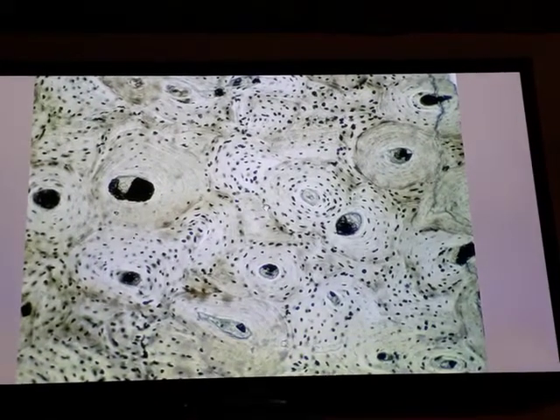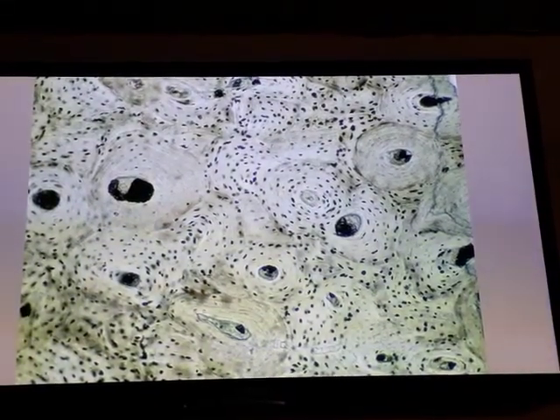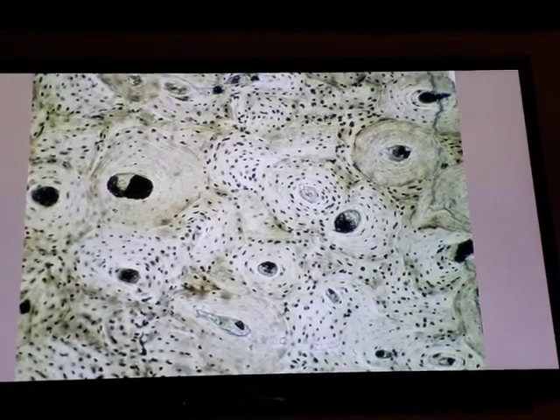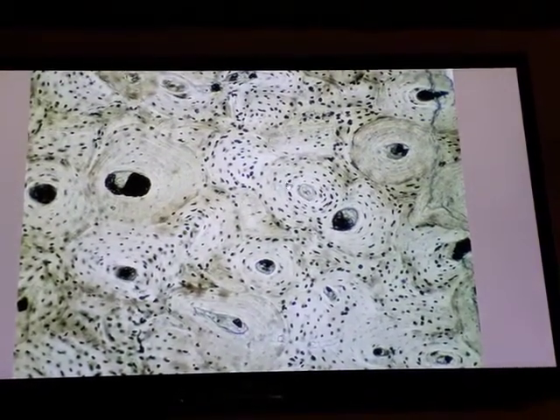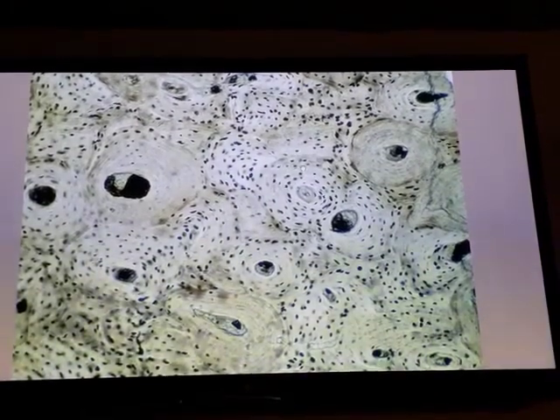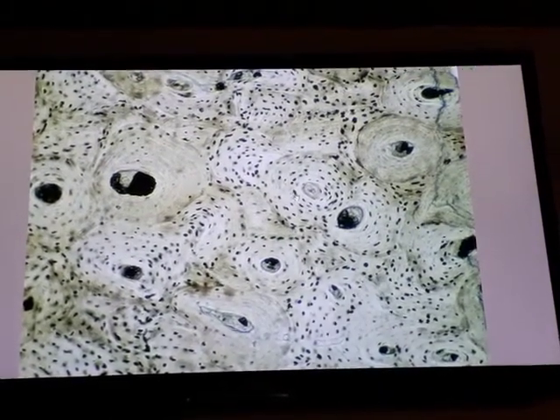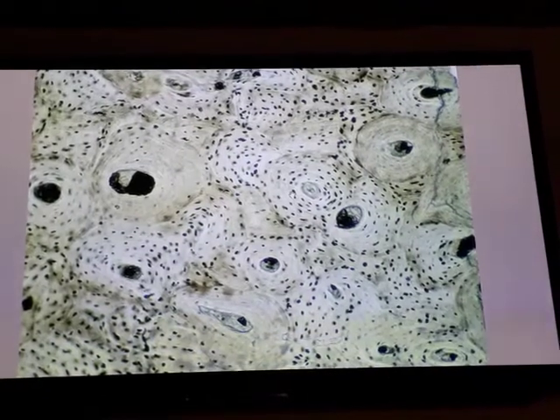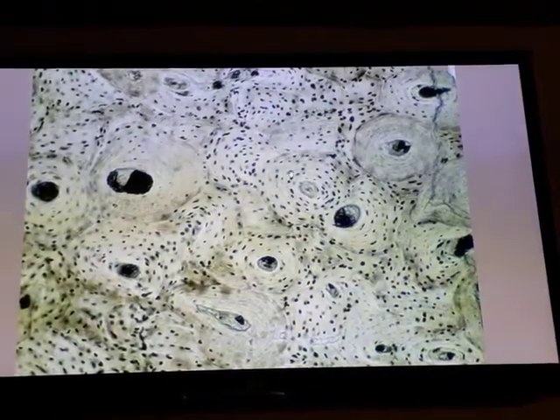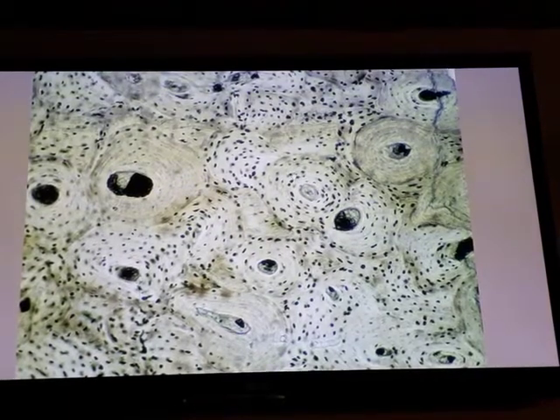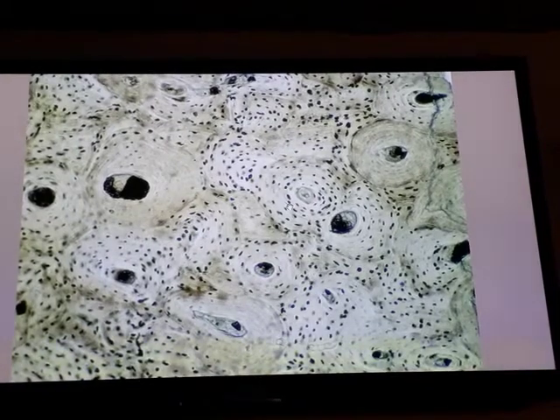Within the laminae, collagen fibers are arranged parallel to each other or concentrically around the Haversian system. These black dots are the osteocytes. These cells are situated between the laminae. Osteocytes are flattened or almond-shaped, with cytoplasmic processes found within the canaliculi.